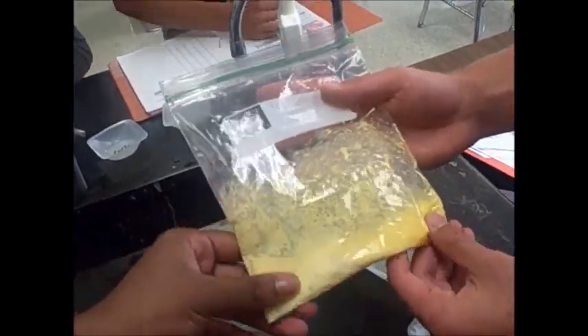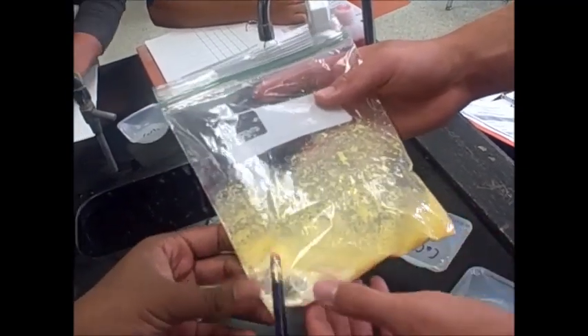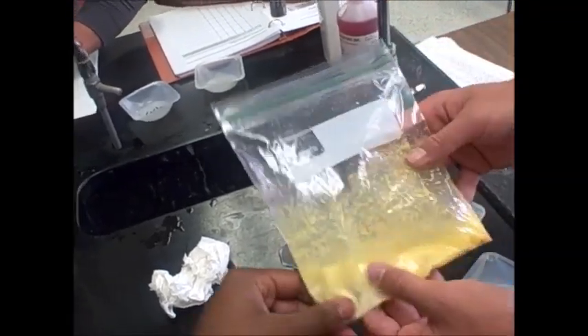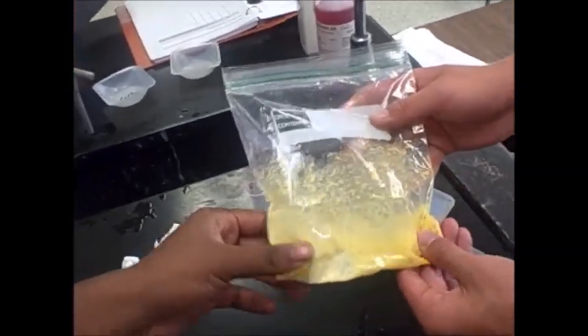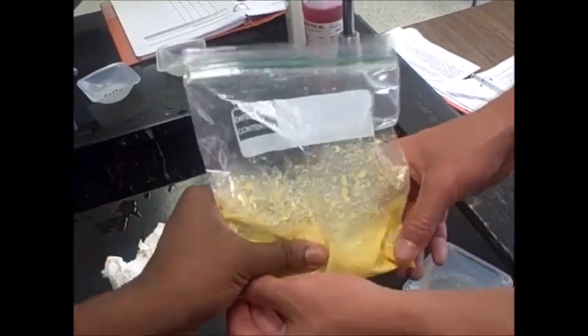Okay, what else do you have? Anything else? The sodium bicarbonate and the calcium chloride dissolved. Okay, it's still warm too. Yeah, it is. Okay, let's see the tail. Alright, yeah, I am ready.